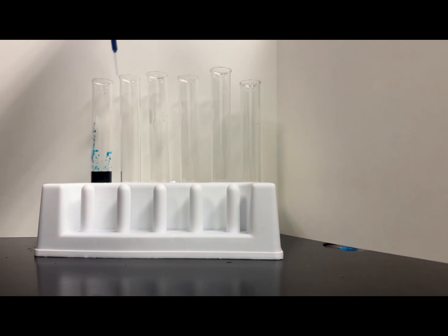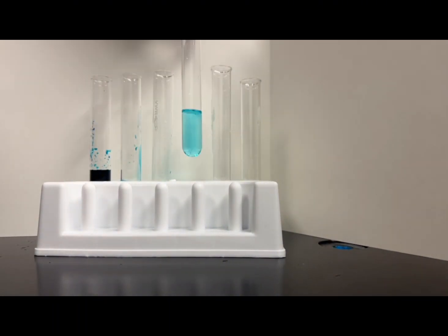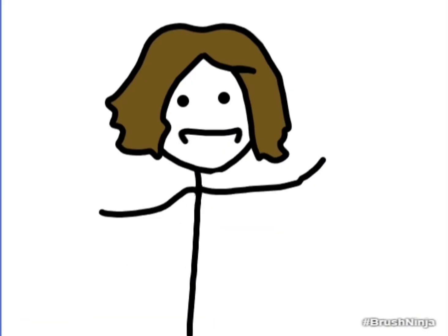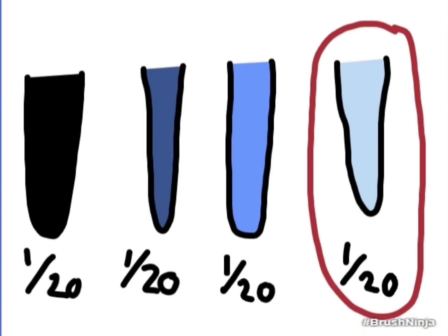Now let's take a look at a 10-fold serial dilution in real life. Let's try out a couple examples. Let's say we have a 20-fold dilution with 4 test tubes. What would the final dilution of test tube 4 be? Pause now.